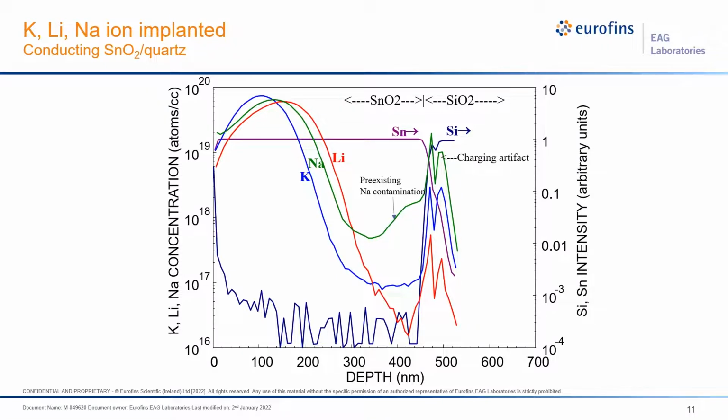They're well designed, so these simulation programs can really get the true distribution of these ions into the matrices in which these implants are made. In a conducting film, we don't see any change of these distributions. So that tells us that even though this is an oxide, because it's conducting, we don't have any mobility of these ions under the condition.